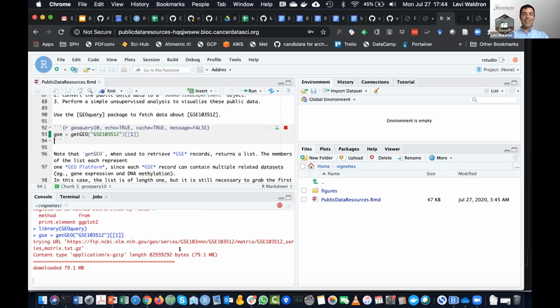And I'm happy, probably, Sean, you didn't actually intend for me to do a live demo of your brand new system in the very first workshop, but it worked out all right.